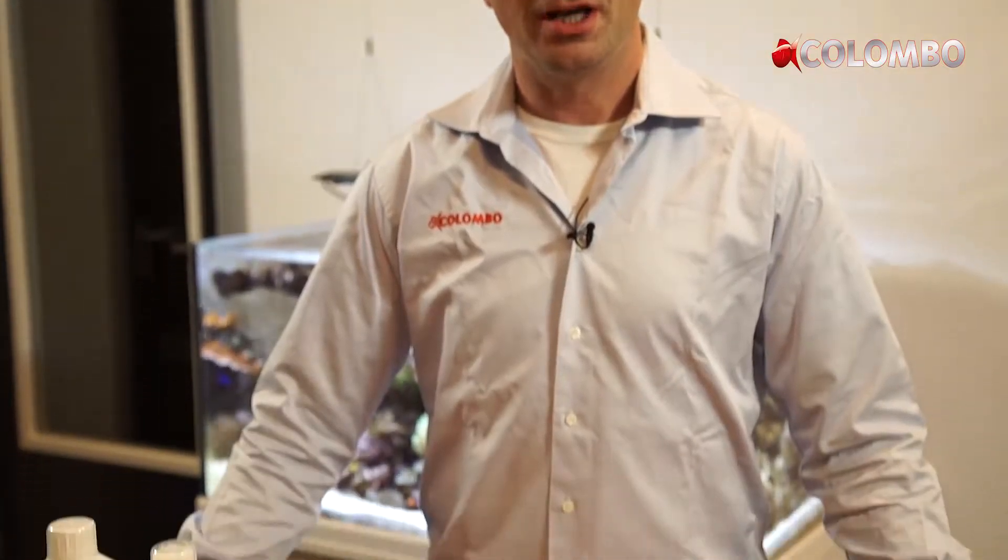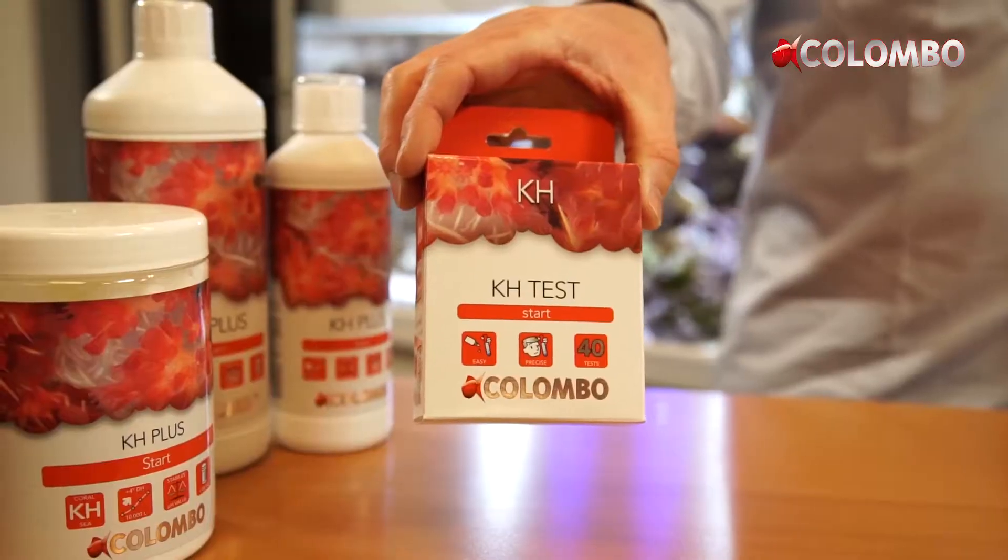Hello, welcome at Colombo. Today we show you how to do the marine carbonate harvest test.